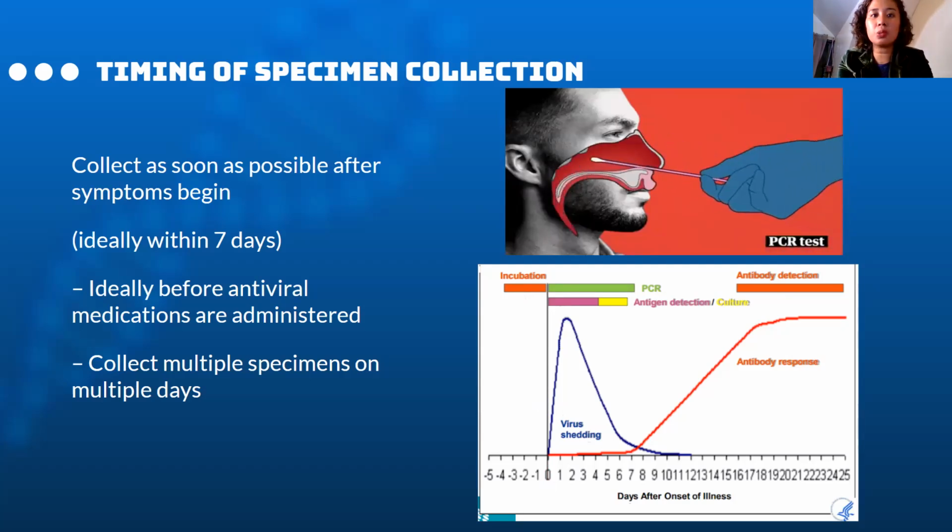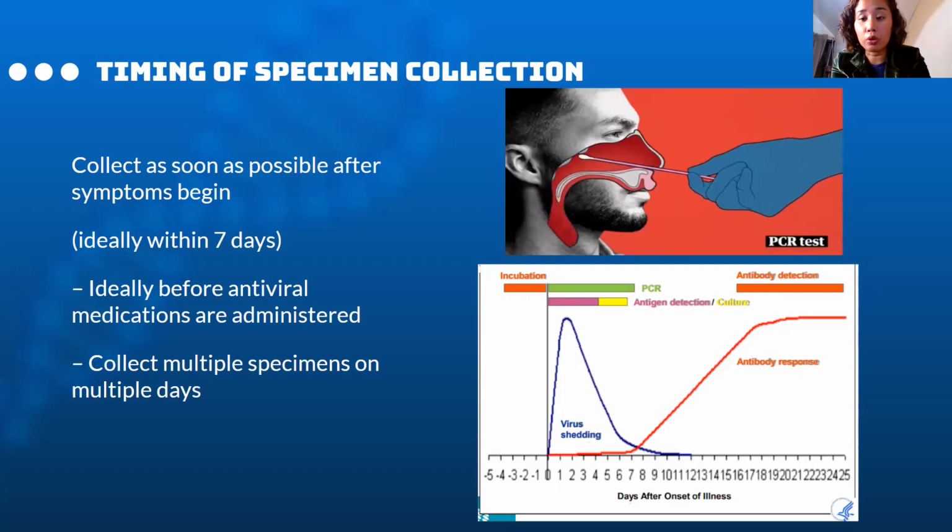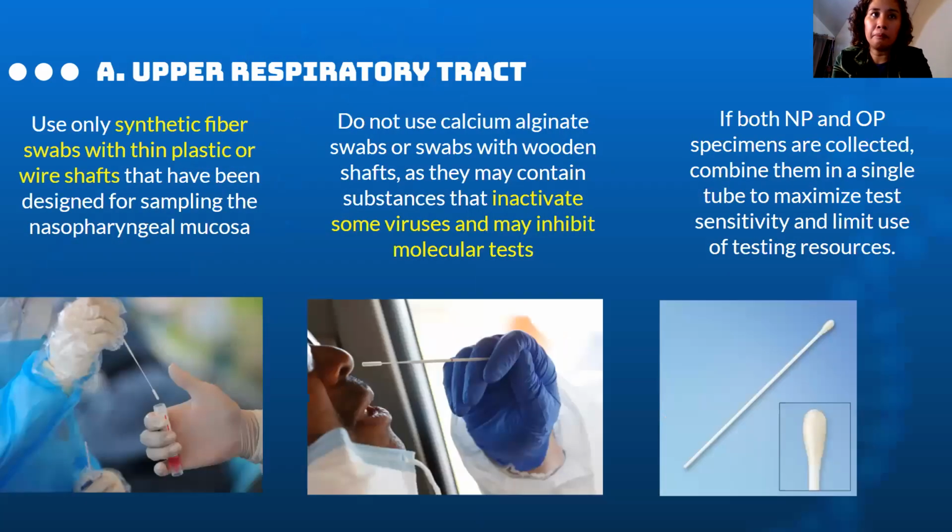Parang kunyari specimen, stool collection. If you want to test for parasitic infection, mas maganda multiple collection, hindi lang once. So for our upper respiratory tract, let's focus on nasopharyngeal swab first.